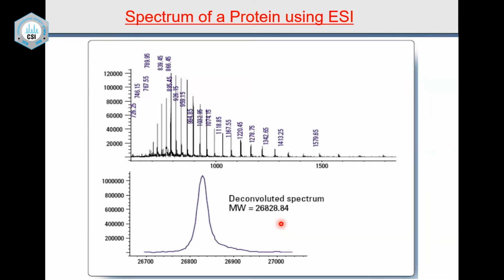It became a beloved part of their instrumentation. That is how the biochemists really embraced mass spectrometry. Today, a biochemist cannot live without mass spectrometry. In any paper that they publish, you will see a mass spec. At any conference in mass spectrometry, 60 to 80% of the papers are taken by them. The small molecule people, pharmaceuticals and others dealing with LCMS, get about a 20, 30 or 40% chance to present papers. That is the world we are living in today. It has become so popular. Without electrospray and APCI, we cannot work.